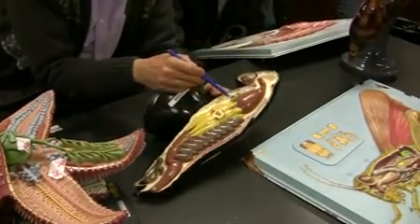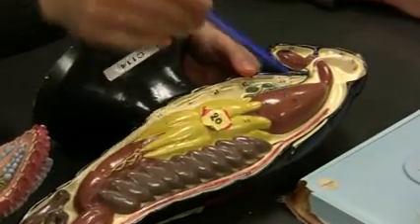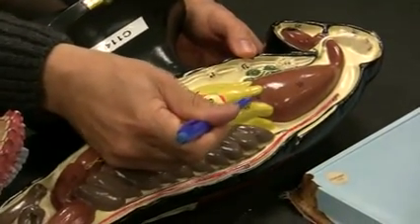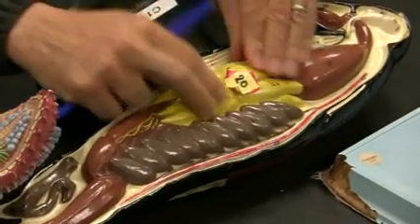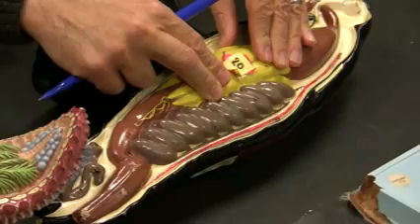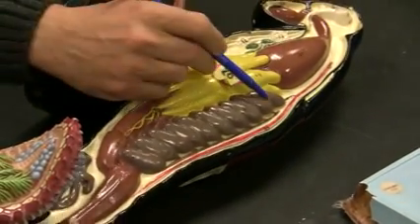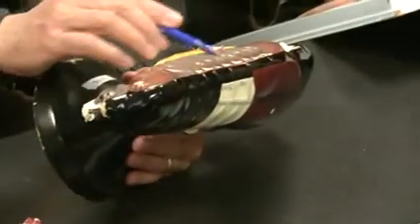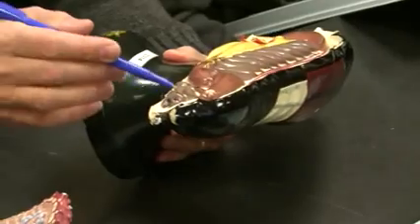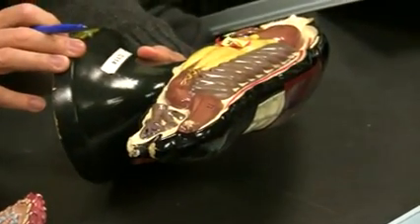Here is the brain, here is the digestive glands, crop, gizzard. From here to here would be gizzard, but the yellow ones is gastric cecum. It's called gastric cecum. These are all gonads. Ovary in this case, this is a female. These are all gonads. And then of course you have vagina and so on and so forth, anus here, and that's all I can recognize.